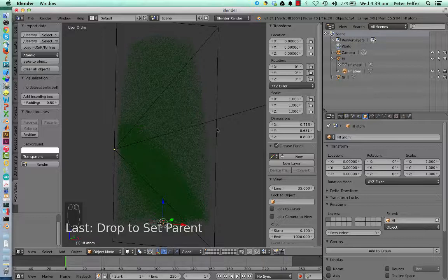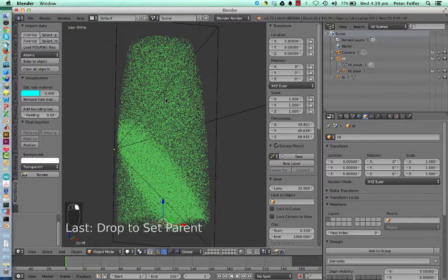What it automatically does also is it tells Blender that it's no longer going to be using the halo material that we set up for the hafnium, but instead uses the hafnium atoms for the visualization. And it puts one atom at each vertex of our mesh. Well, there's no mesh, it's just the vertices by themselves. So it's going to put one everywhere where there's an atomic position.